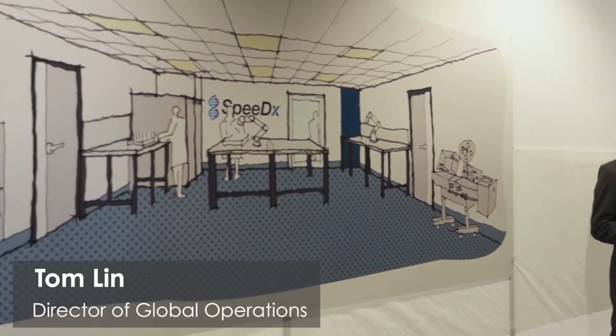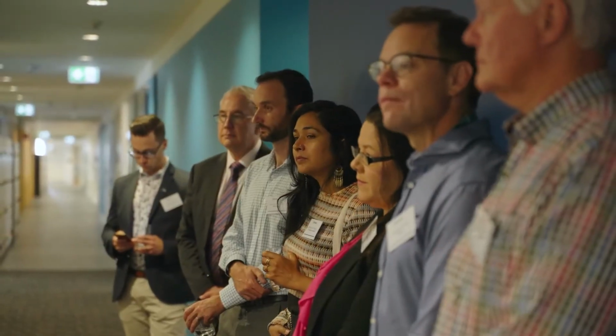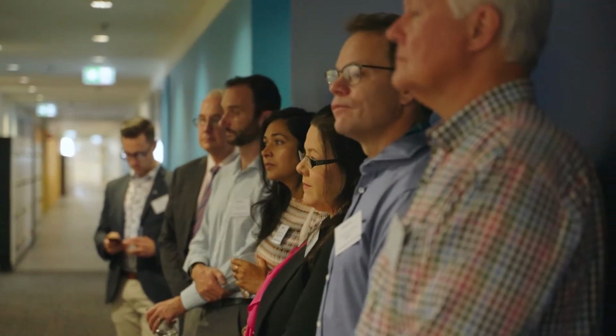I look after manufacturing operations as well as supply chain. What we have here is going to house an ISO class clean room so that we can build an all-purpose manufacturing floor. The design of the production floor is going to be open space, so we can wheel in and wheel out the machinery as required. We will be using quite a lot of automation. Right now you don't see a lot because it's an open canvas. What's behind it is going to be able to facilitate, I think we're aiming for, more than 4 million tests per week.